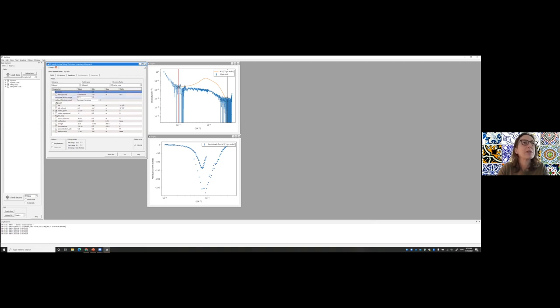It asks you now, what's the structure factor mode and what is this question? So it's asking you, do we just do a P(Q) times S(Q)? And, you know, remember the magical intensity formula, or do we apply that beta approximation? And we're going to say, yes, we want to apply that beta approximation because we know, and that's the model that we're using, that we're not going to have perfectly isotropic interactions between the particles because it's not a perfect sphere. So we're going to use that.